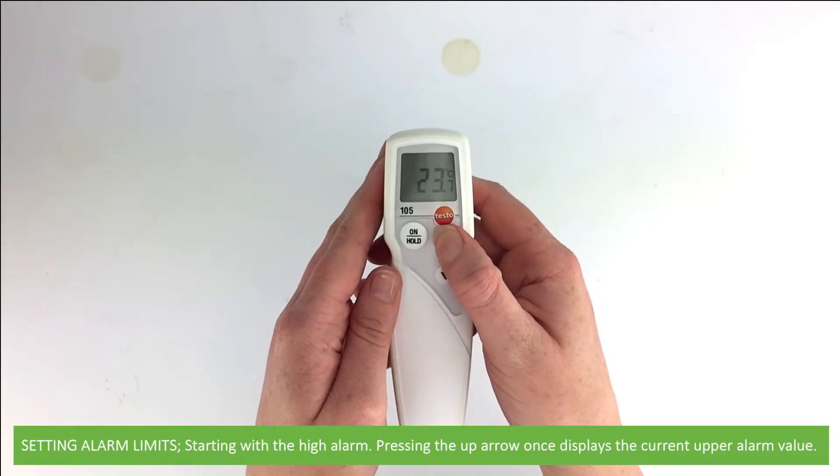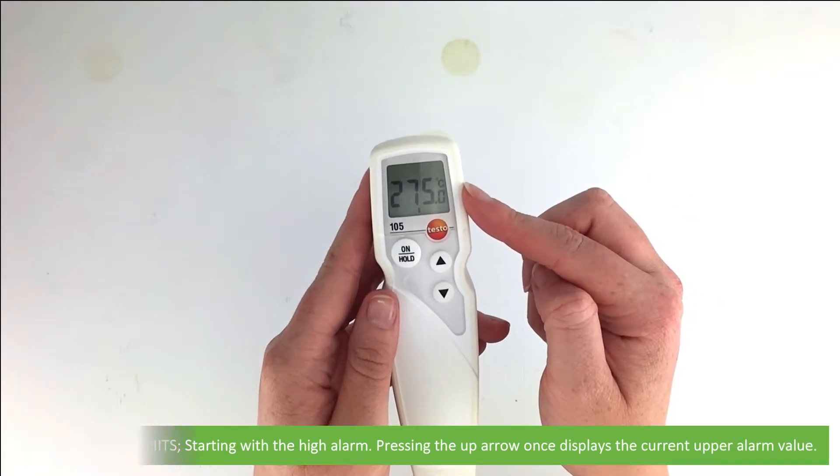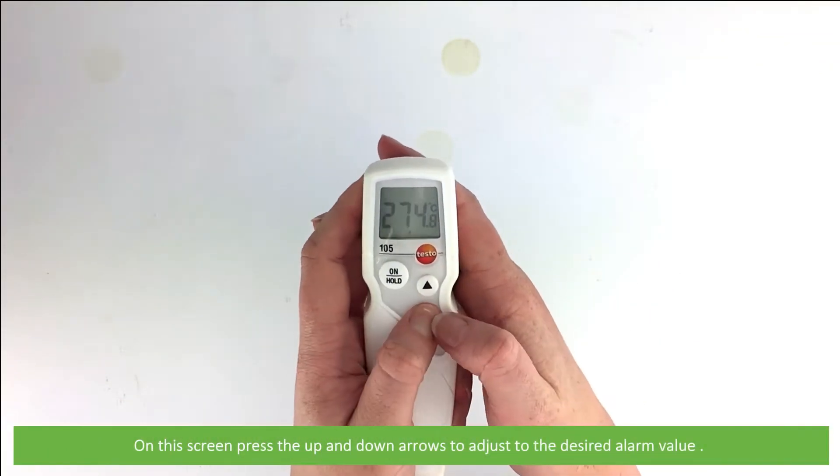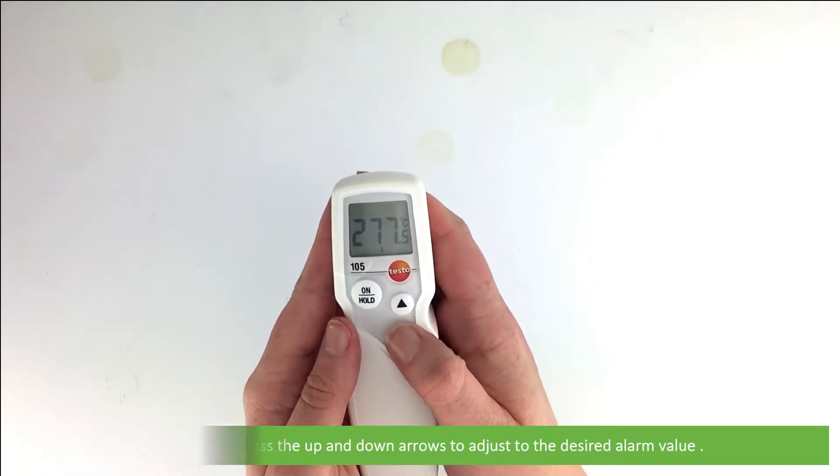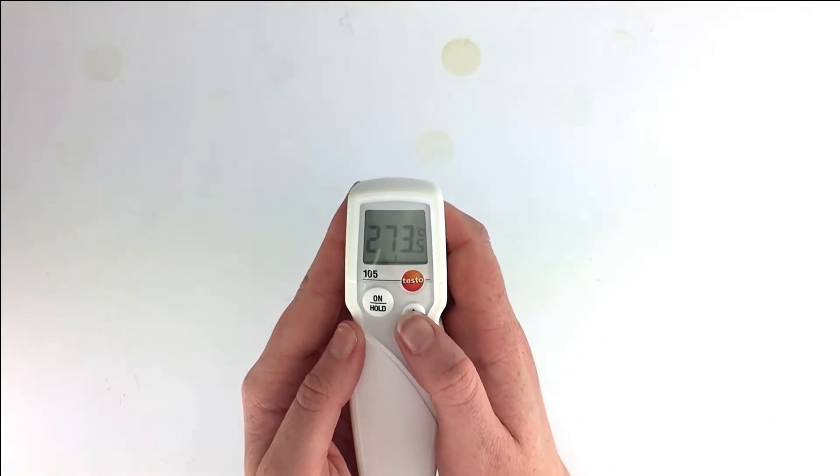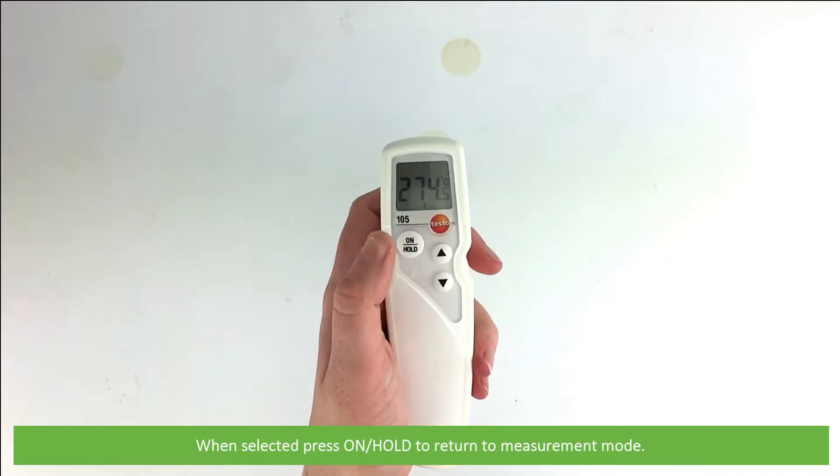Setting alarm limits: Starting with the high alarm, pressing the up arrow once displays the current upper alarm value. On this screen, press the up and down arrows to adjust to the desired alarm value. When selected, press the on hold button to return to measurement mode.